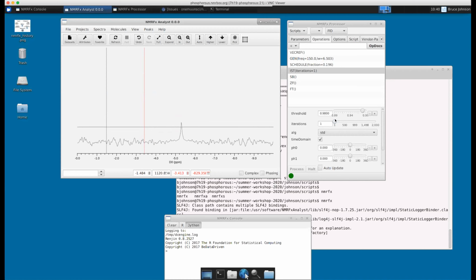So then next time I transform, the ratio between the signal and the artifacts is higher. And so I can cut my threshold a little bit lower because the artifacts keep getting lower and lower. I can keep moving my threshold farther and farther down, and so I'm able to encompass more signals.